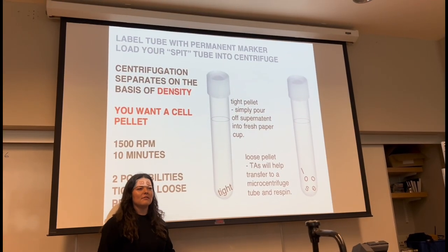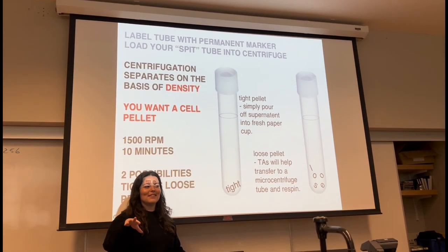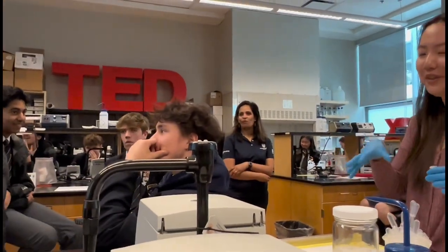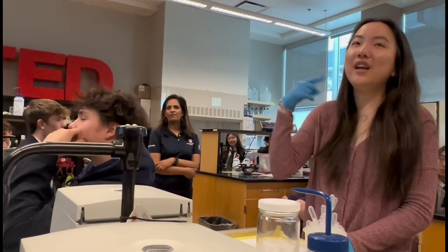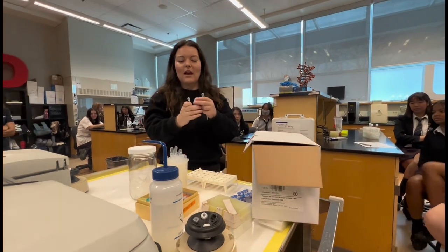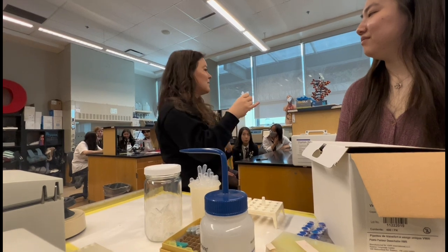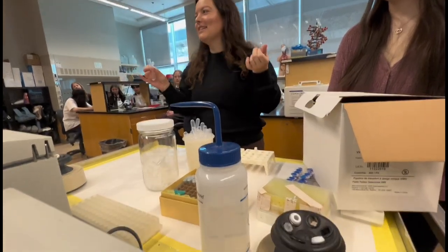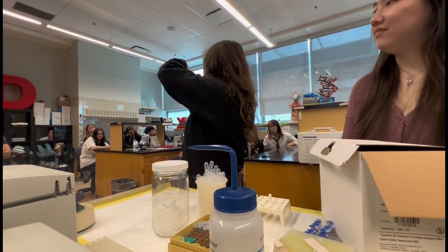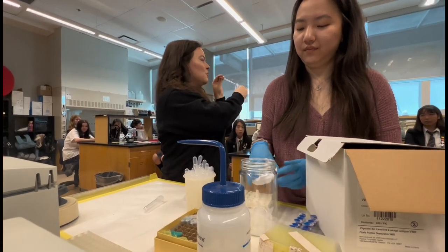Do you know what a centrifuge does? Yes, it separates the contents based on density. That's exactly right. It operates at revolutions per minute — this tabletop one runs up to 14,000 RPMs. You pop off the cap, sample it, squeeze the pipette before going to the bottom. You have saline in here, but you don't want the saline carried over if you're interested in the cell DNA. Stick it all the way to the bottom of the tube where most of your cells are, suck up from there, and empty that into this tube with the Chelex beads.